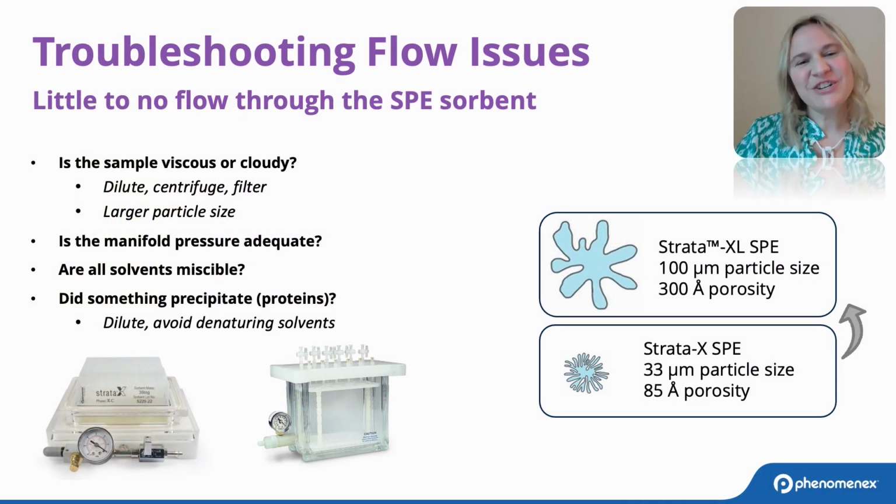One of the first questions that you're going to ask yourself when you're troubleshooting SPE flow issues is, is this happening during my loading step, the loading of my sample, or is it happening before I load my sample, with the conditioning steps or with the blank?